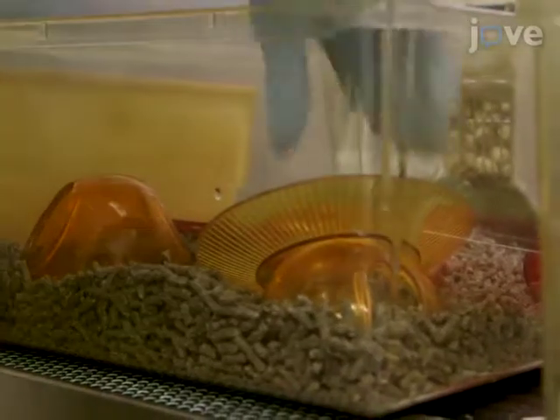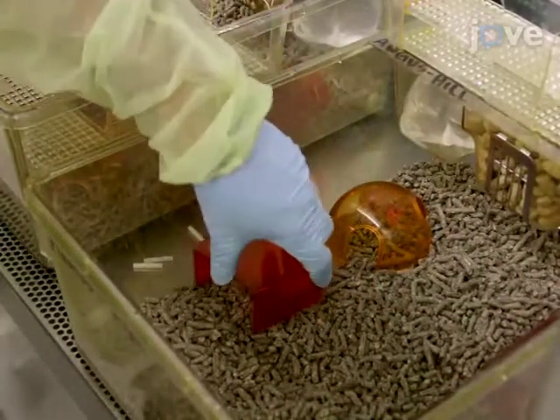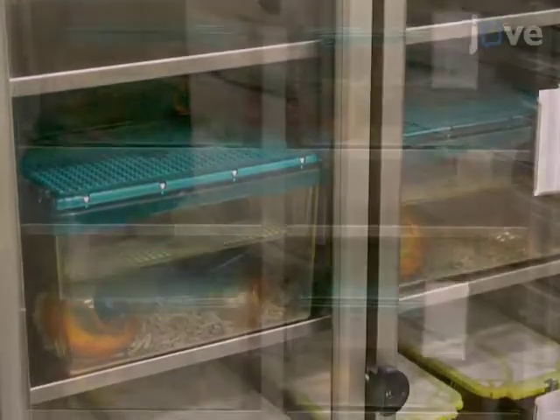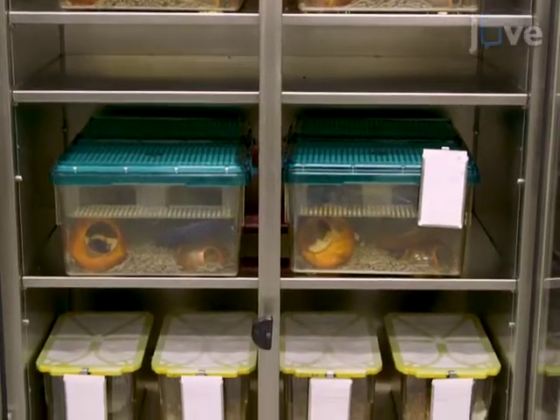For EE, also provide sterilized running wheels, tunnels, igloos, huts, crawl balls, and nesting material. Place both the enriched and the control cages in the same rack to provide equal ventilation.